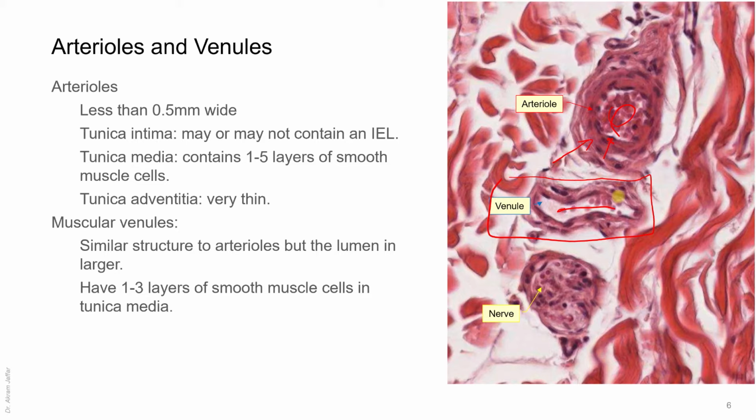And this is a vascular bundle, which is also accompanied by a nerve. And it is surrounded here by collagen fibers. This is a dense irregular connective tissue. So you can see collagen fibers in different orientations. Here's a longitudinal one, and this is an oblique orientation. And the whole is called a neurovascular bundle, because it's a nerve and blood vessels, arteriole and venule.